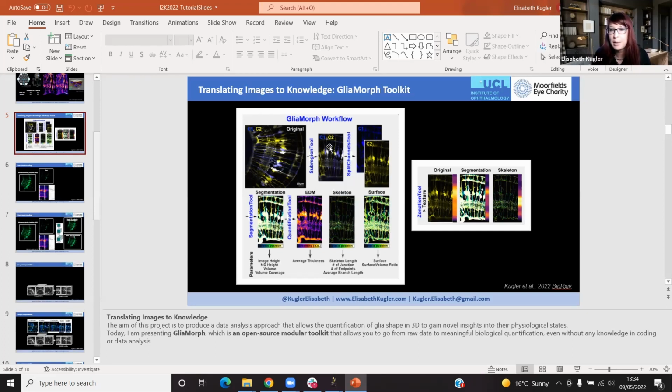That was kind of the first step. For today, we just have a single color image, so we're not going to talk about the split channels tool. But the next thing that we're going to talk about is how we can look at the data in a little bit more detail with the zonation tool, which is basically plotting these graphs that we're looking at in a moment. Does that answer your question?